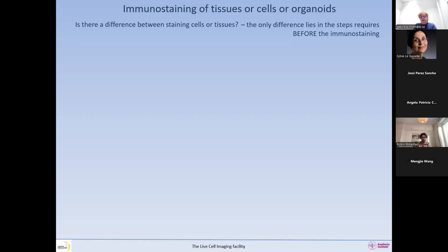Is there actually any difference between them? The difference lies in the steps required before the immunostaining.